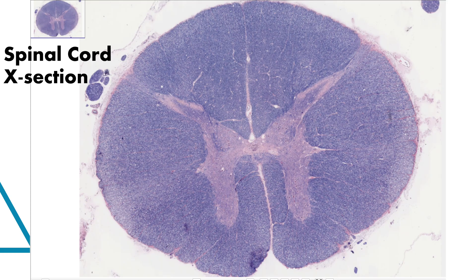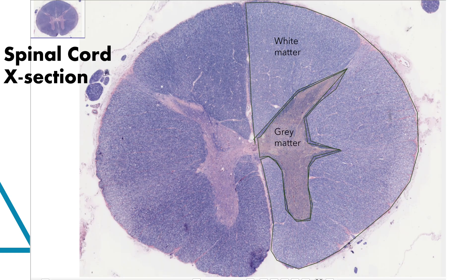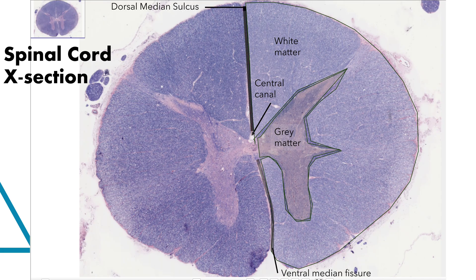The final slide we will look at is a histological cross-section of spinal cord. The spinal cord is composed of two things: an inner layer of gray matter and an outer layer of white matter. Gray matter is composed of the cell bodies of neurons and unmyelinated axons. White matter is composed of myelinated axons. Running through the center of the spinal cord is the central canal, which brings cerebrospinal fluid, or CSF, down from the brain. Bridging between the left and right halves is a gray commissure carrying unmyelinated axons and a white commissure carrying myelinated axons.